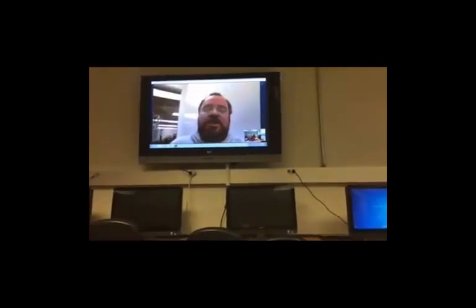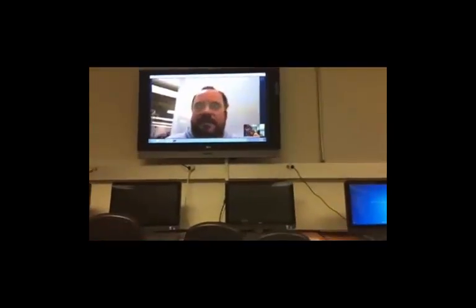So Lita, I'm going to go ahead and just give it back to you. I'm going to log off from your computer and give it to you, okay? Okay, I'm going to go now. Before you go, I turn on the HPLC mass, HPLC easy sequence, and then that runs the sample, right? Yep, and just let me know in half an hour when you're all done. Okay. So I can turn off the gas, okay? Okay, like half an hour, okay, Lita?